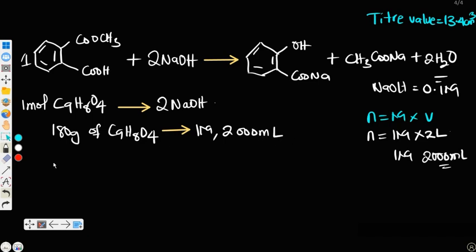Right? Now, at the end of the day, to find our milli equivalent, first of all, we have to convert this 1 molar, since we used 0.1 molar sodium hydroxide for our titration. That's why I said, before you get your milli equivalent, go back to the titrant, the concentration of the titrant. That's what determines what you will find for your milli equivalent. So this one will be divided by 10.